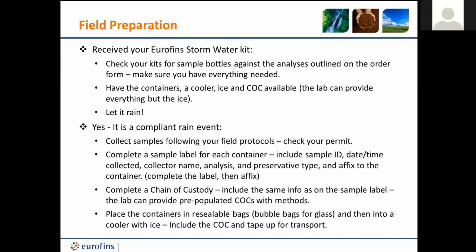There's a question up here asking, if we use your lab, do we need to use your COC exclusively, or can we create and send you our own COC? You can use your own COC. We only ask that everything is on there that we need. The chains of custody are the first thing that get attacked in a court of law, basically, for any reason. So it can be challenged. So if your tests aren't on there, your sample IDs, your sample collection points, the sampler, the date, the methods, all of that information, if it's not there, they can challenge it for legal reasons if they want.